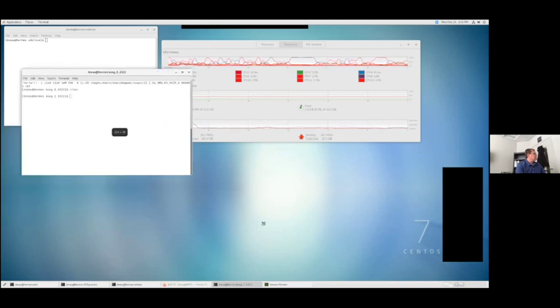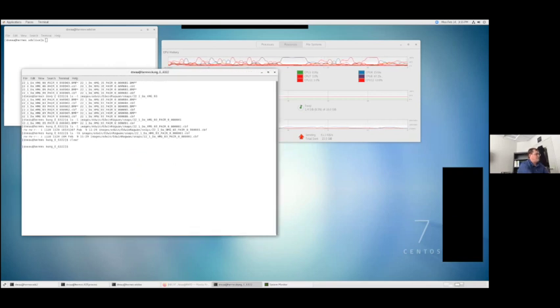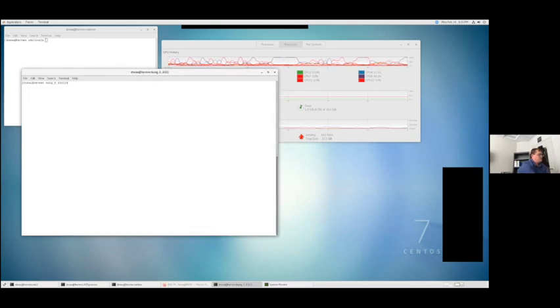So one other thing that Rapid does is in the data that you downloaded. Here I'm again looking in that same data collection trip, at the files that were created from that trip. I've gone into the main directory, so you can see Kung_E_6322.